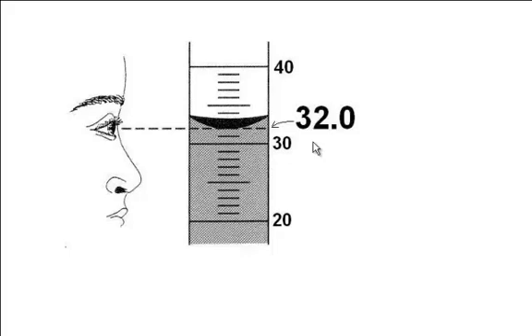But remember from our video before, we have to make a guess. If it appears that the meniscus is sitting right on the 32 mark, our guess would be 0. Why take the guess? Because in every measurement you take a guess. Now if there were just a tiny bit more fluid in this graduated cylinder, it might be 32.1. Tiny less might be 31.9. That last number is significant. You need to record it.